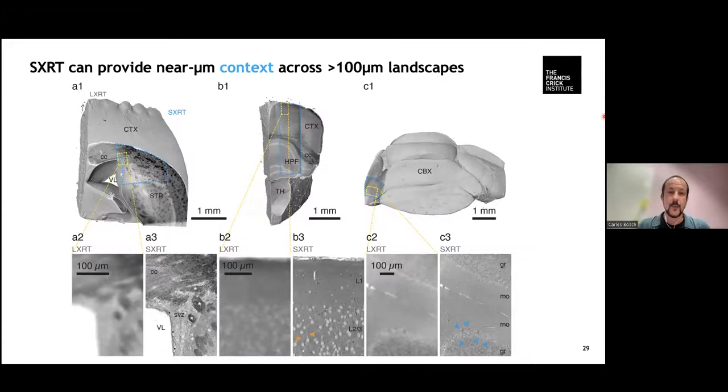And I would say that we explored all those different brain regions. We are mostly interested in olfactory bulb in order to widen the interest to the wider neuroscience community. But this should also serve as an example that those kind of data sets can not only be obtained for brain samples, but for any soft tissue sample, be that lung or heart, to name a few. So it is predicted that cell bodies and fibrous tissue agglomerations, within those sizes and ranges, should have enough intrinsic contrast to be resolved as well in those cases. And so this technique should be relevant for those.